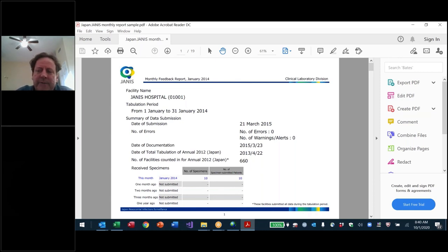Treatment guidelines are often the worst application of resistance data. It's one of the most desired. You want the microbiology lab data and you want to apply it to treatment guidelines. The problem is the biases. If your data are not representative, you are overstating resistance. You're telling the doctor that gentamicin is 40% resistant, but in the general population, it might not be 40%, it might be 10%.